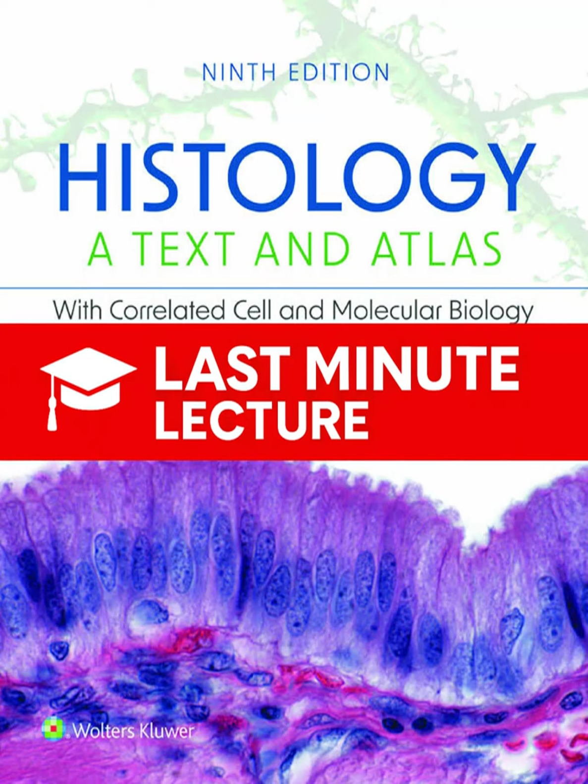structure actually performs. And when we talk about the methods to do that, the landscape today has just exploded. The sources we have are fantastic because they don't just stick to the old school light microscope. Not at all. They highlight this incredible diversity of tools we have now. We'll start with the traditional workhorse, the light microscope, or LM, and its digital cousin, virtual microscopy. But then we're going to get into the really high-res stuff.